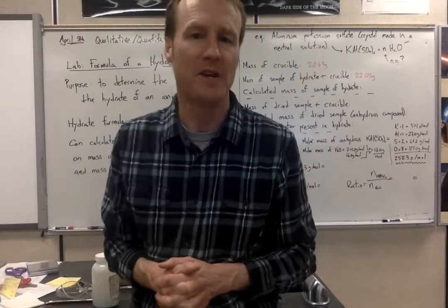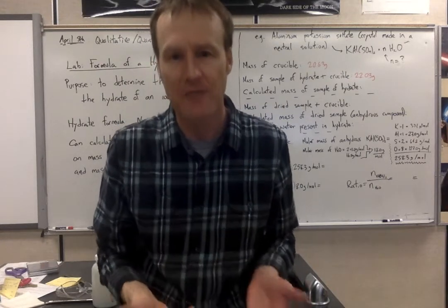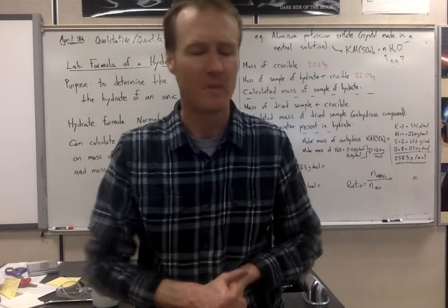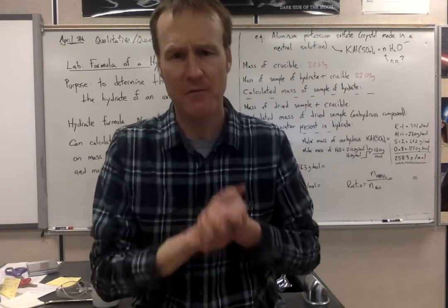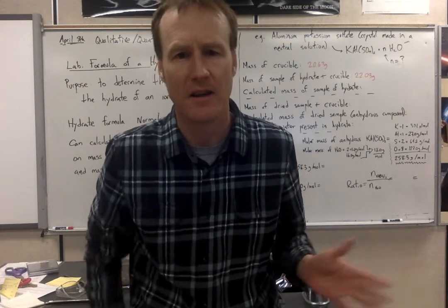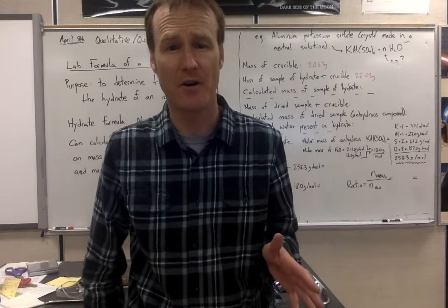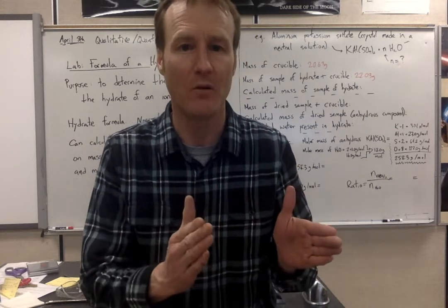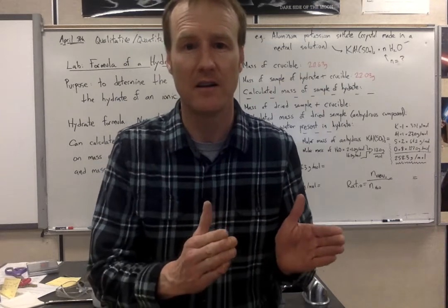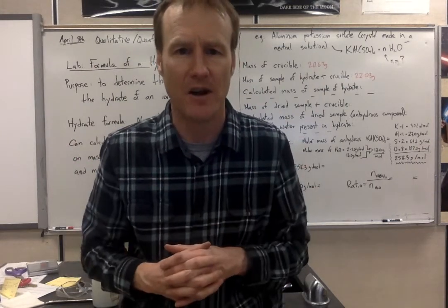Aluminum potassium sulfate is also called alum. It's used for pickling meats. It's a fairly safe compound to work with. It's also a hydrate. Now, the stuff that you get out of the chemical cabinet is aluminum potassium sulfate dodecahydrate. That means it's got lots of water in it. Every formula unit of that compound has got 12, as in dodeca, water molecules around the ions.